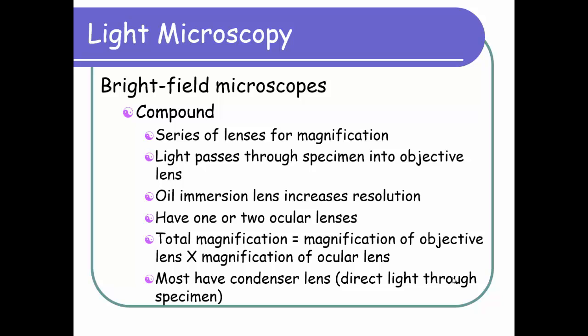Our scopes are binoculars. The total magnification will always equal magnification of the objective lens times the magnification of the ocular lens, which on our microscope is a 10x lens. In other words, if you took just the ocular lens and could focus close enough on an image, it by itself would magnify the image 10 times.